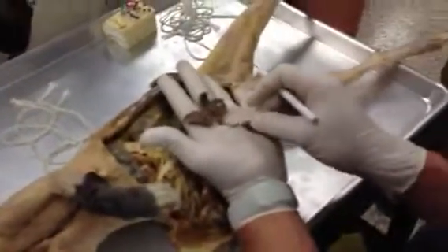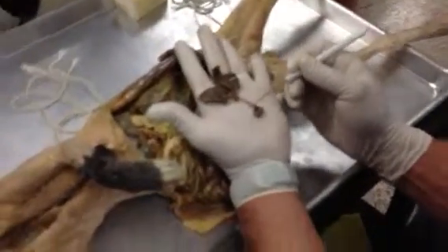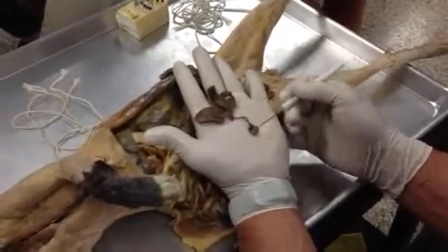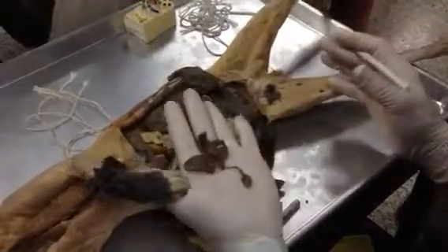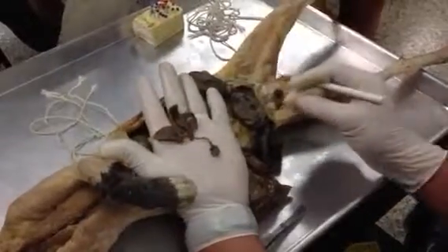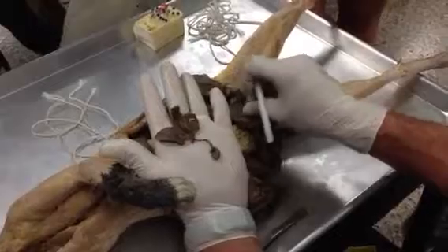And again, like I said early on, we really can't see it all that great. Okay, so there's the umbilical cord, placenta, and this is called the fetus. Alright? And like I said, we don't have a better one, but at least we're seeing a pregnant cat. I can't see the amniotic membrane, which is listed there, so amniotic membrane won't be part of the exam.